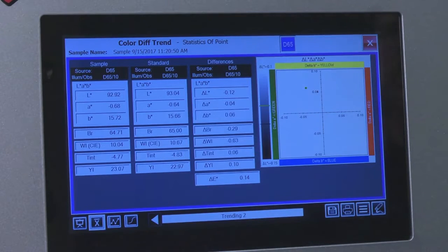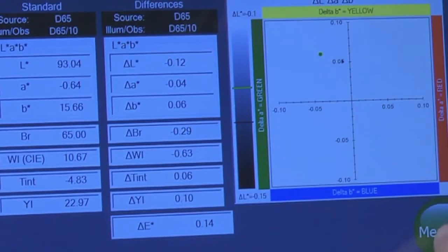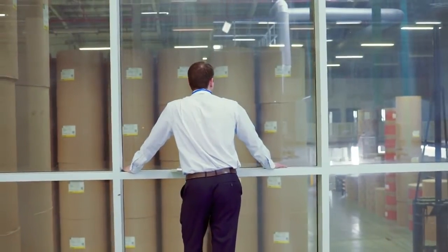Technology onboard includes a new, improved touchscreen interface. Testing routines have been simplified, allowing you to see results faster and more accurately. Opportunities for human error have been eliminated.